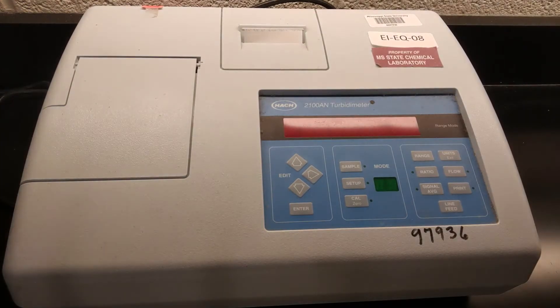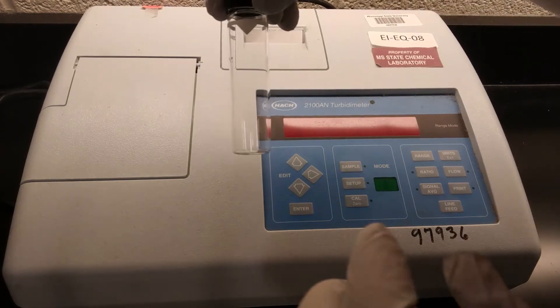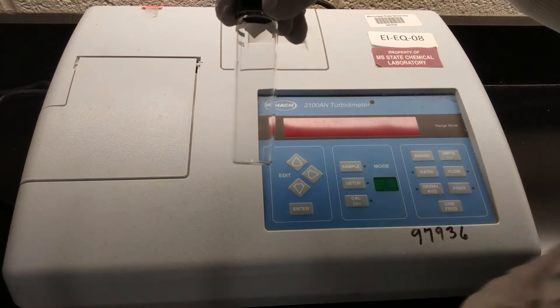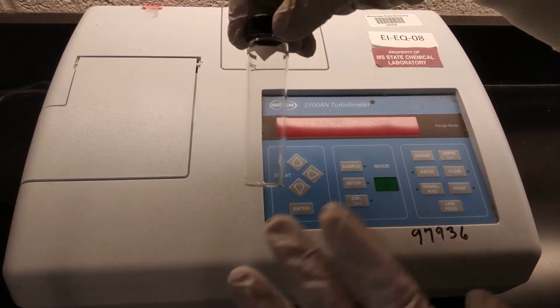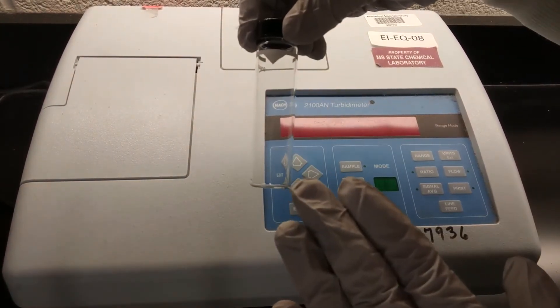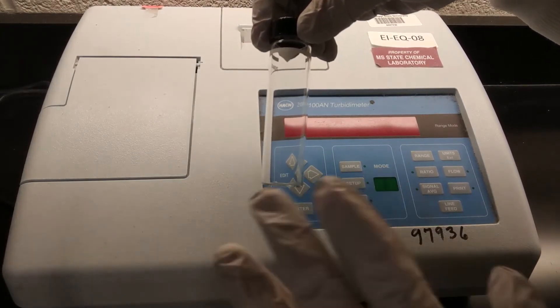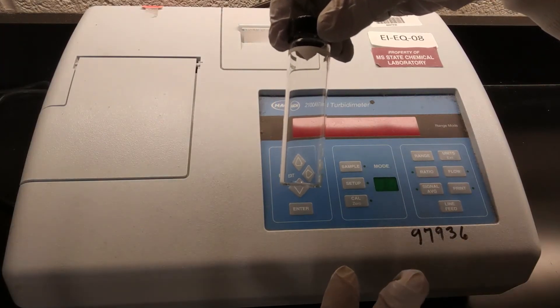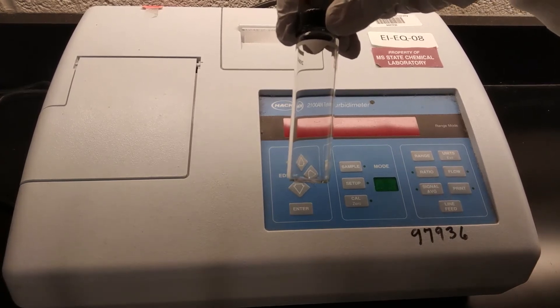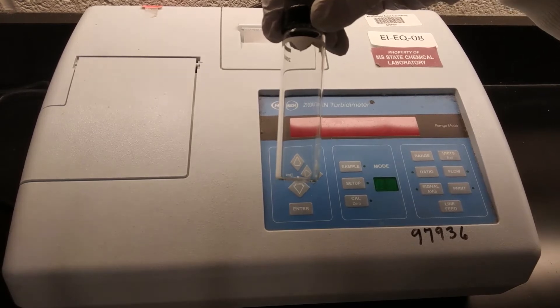One thing to really keep in mind before you start doing this analysis is that this is an optical analysis. And so what that means is we're going to be shining light into and through our samples and measuring the amount of light coming out of the cells. What that means in practical terms is that you want to avoid touching the sides of this cell as much as possible, and especially you don't want to be touching it with ungloved hands because the oils in your hands will get on the sides of the glass and then that will interfere with the optical measurement.